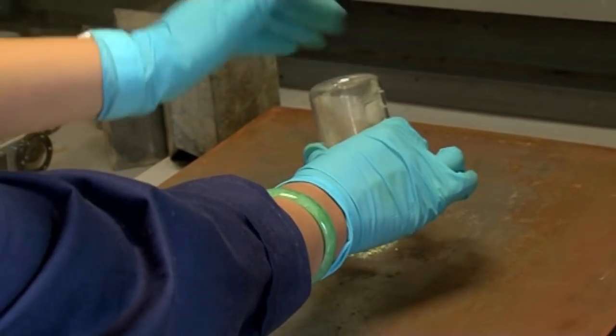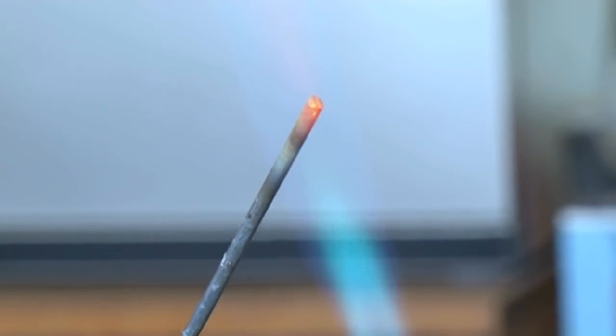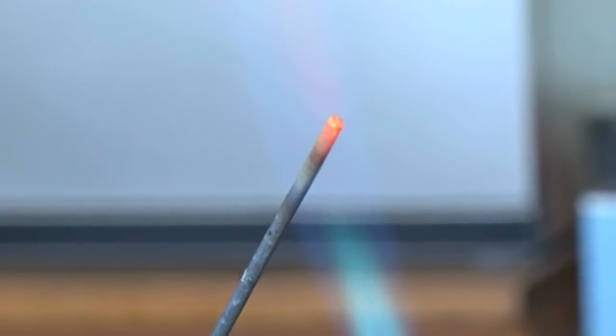We've got a mixture of our zinc and sulfur, and in order to start the reaction we're going to need a source of heat. And instead of using a flame or anything like that, we're actually going to use a hot metal rod to get that reaction started.